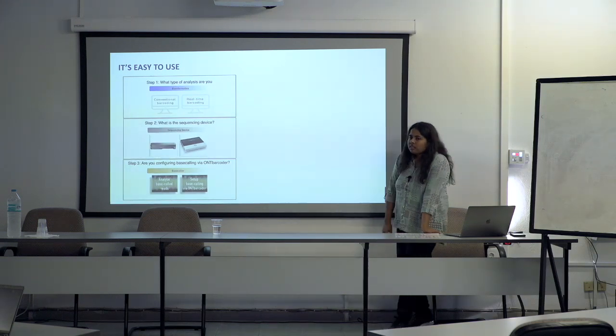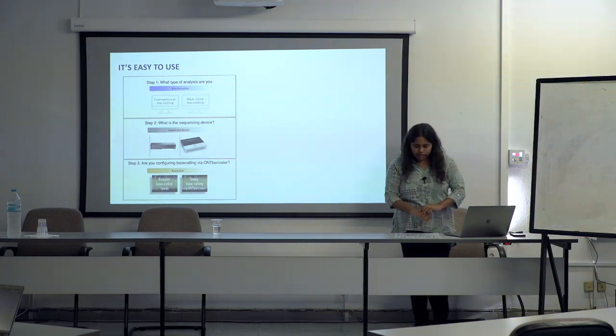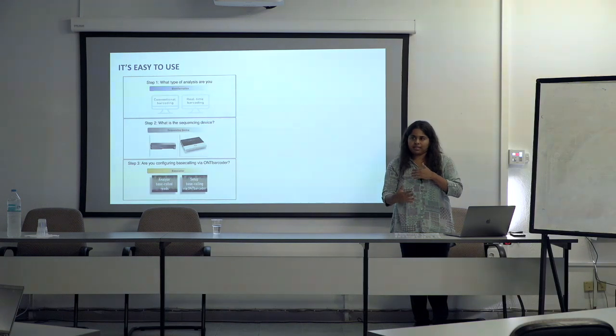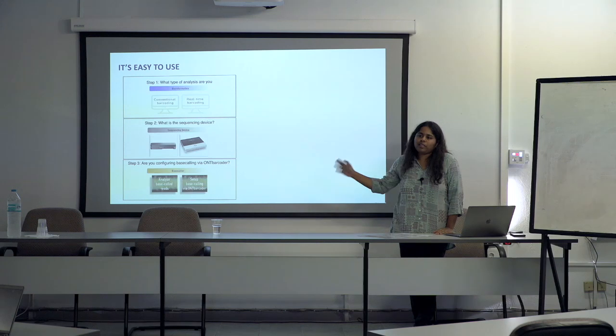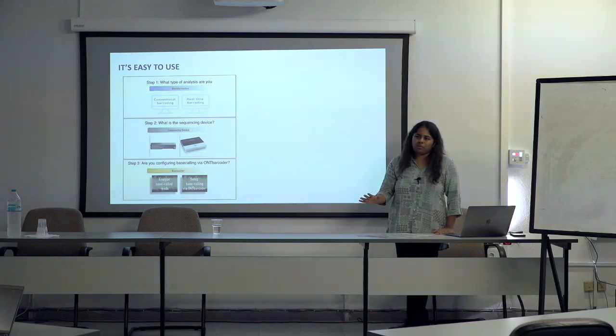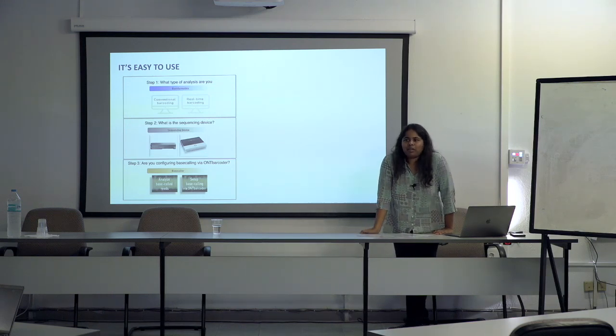So I think with 10.4 this is doable. We have looked at data, and what we have been exploring right now is whether the dominant sequence is the right one. Simple as that, because we really have so many identical sequences. Of course, it will have a few barcodes with indel errors. So we need to explore this more. Does that matter? Probably not for 97% clustering type of OTUs, but it might matter if you're wondering about one base pair differences. So we need to figure out what works there.